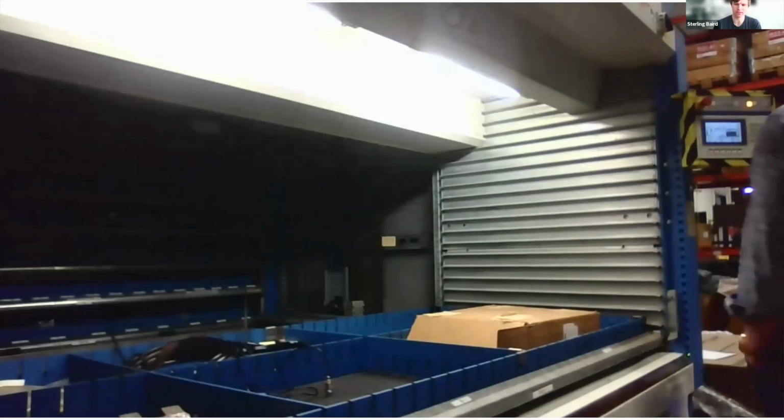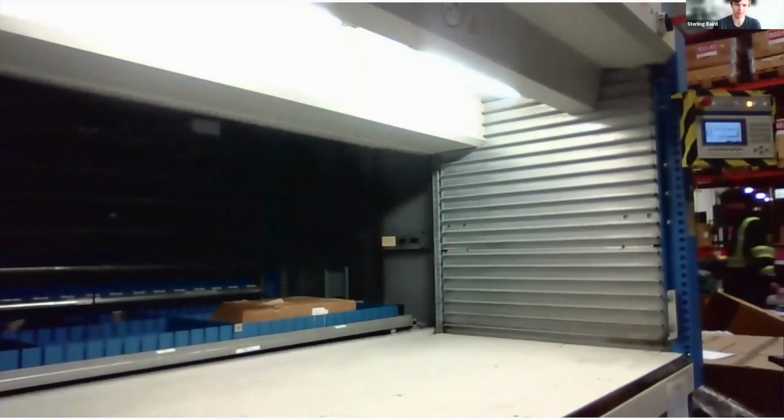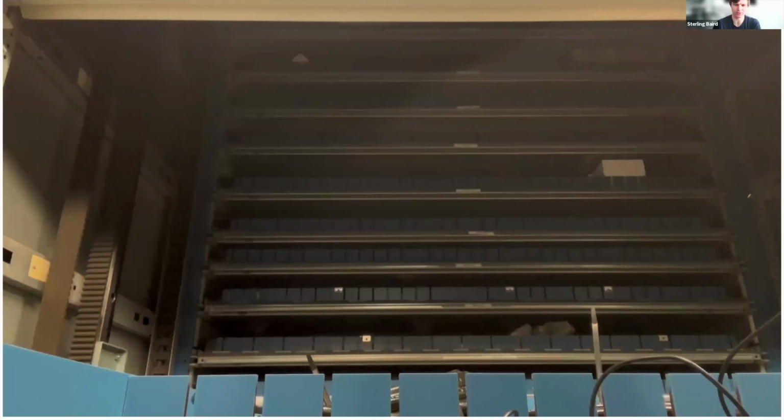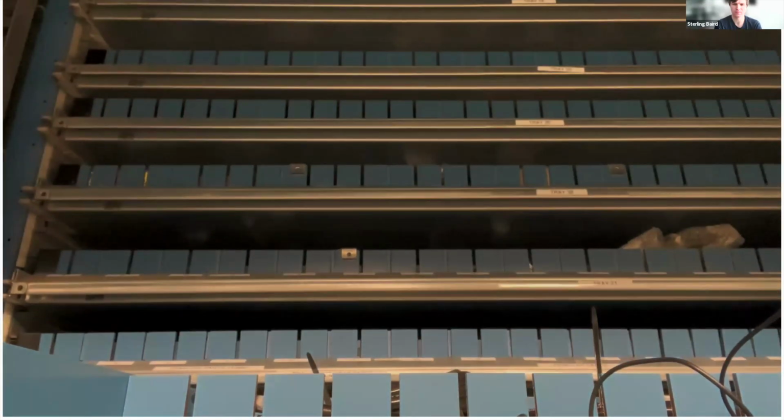This is an example of a vertical lift system, a vertical lift module in use. If we take a look as if we were riding the tray, we see it coming up towards the top. We'll see a little bit of the light coming through the ceiling. It going into position. And then coming back down.